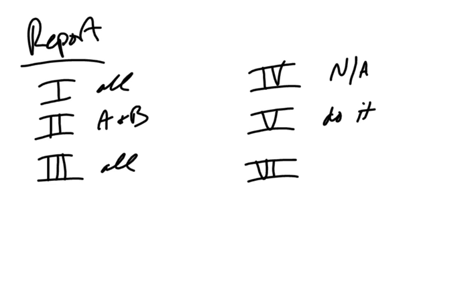That means you need to show the limiting reactant problem and show both reactants to find out how much calcium carbonate you can make. So you should have a molarity calculation and a limiting reactant calculation. Also, number 6, you're going to have A, B, and C.